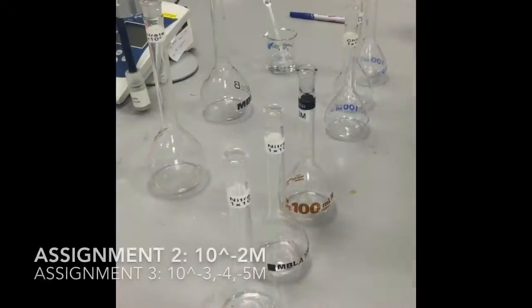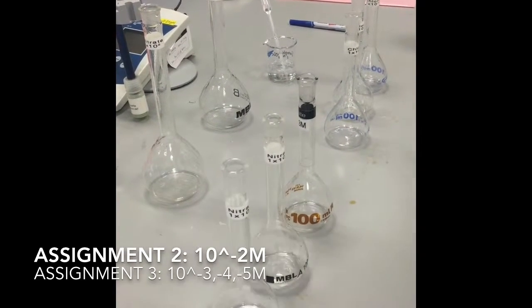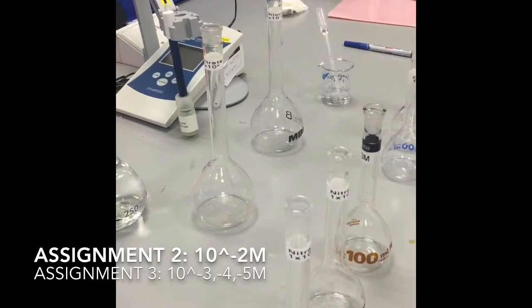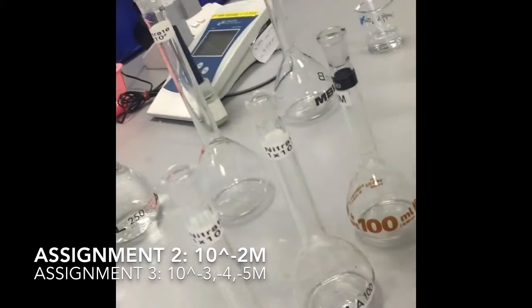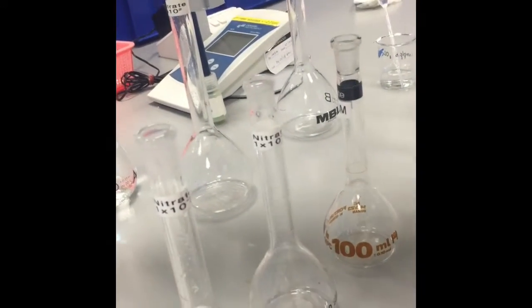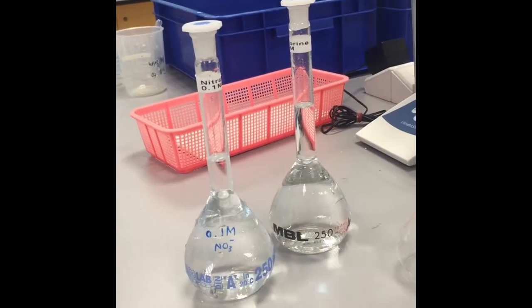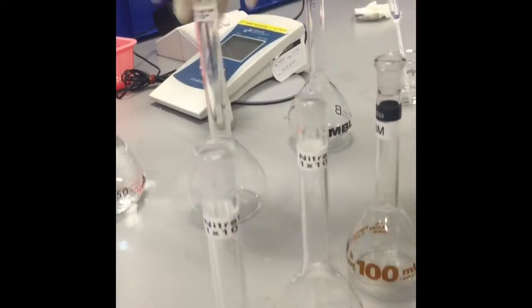So basically, we're going to prepare for assignment 2 and 3. Assignment 2 is preparation of 10 to the power negative 2 molarity, as well as assignment 3, preparation of 10 to the power negative 3, 4, and 5 standard solutions. Previously in assignment 1, we have diluted calcium nitrate and sodium chloride into the 250 ml volumetric flask, which is 10 to the negative 1 molarity.